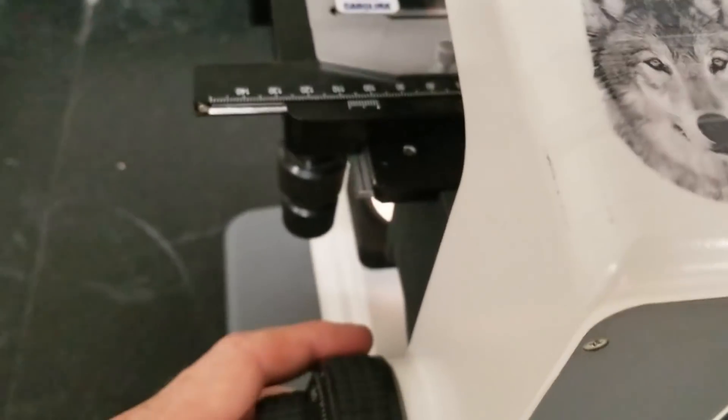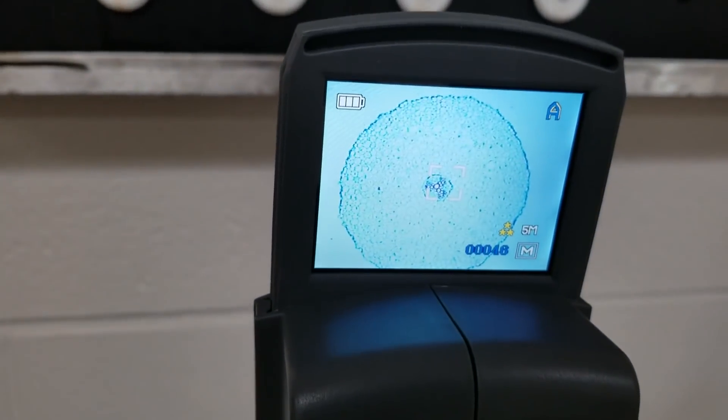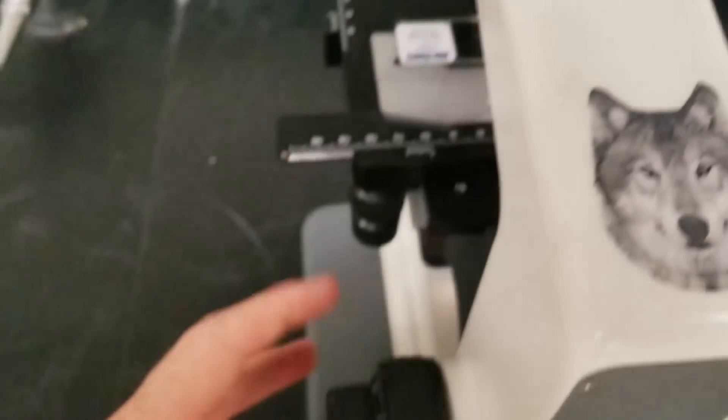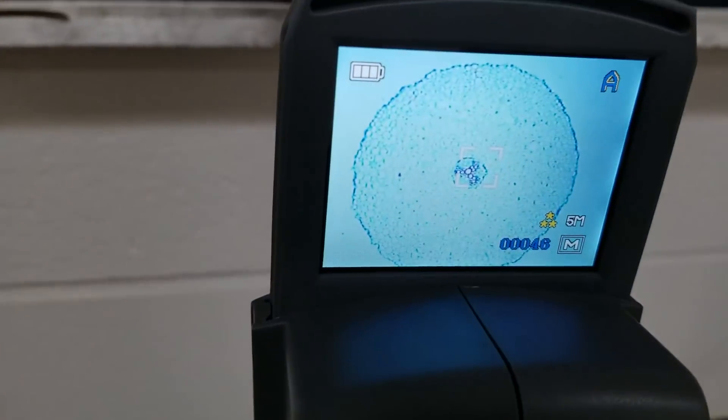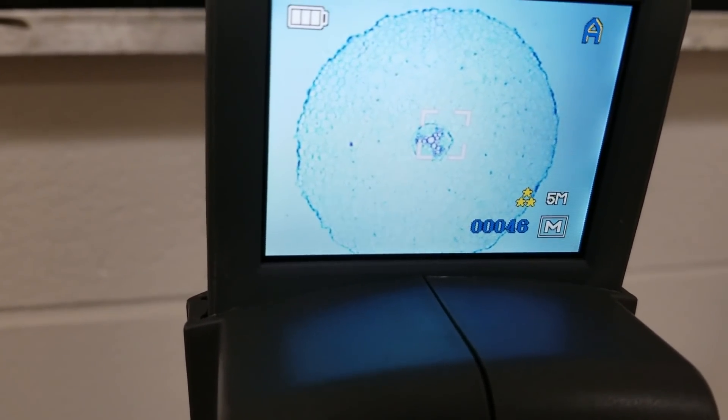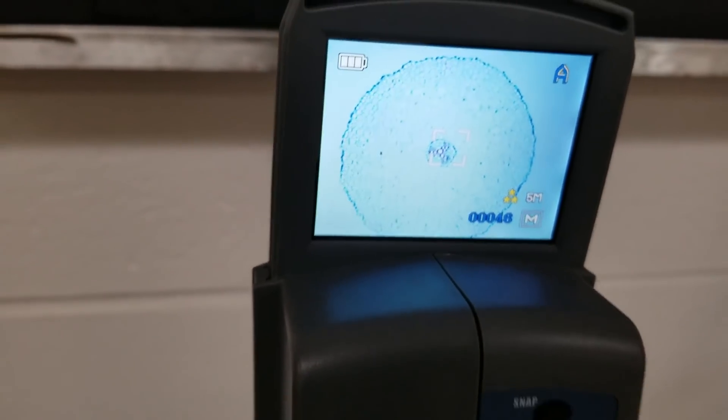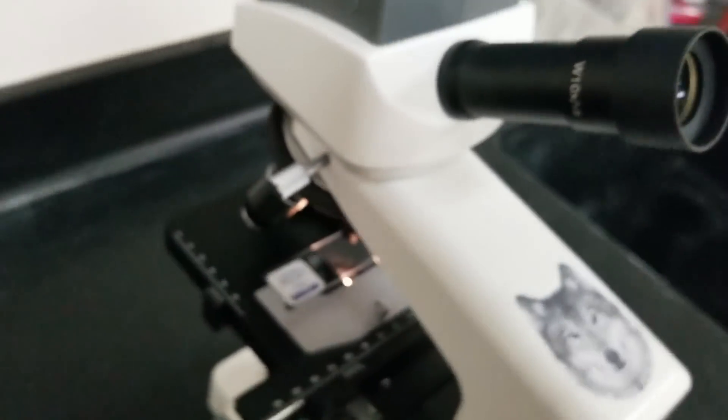Remember, coarse adjustment knob is the big one. That's pretty clear. Then I'm going to use the fine adjustment to make it as crisp as I possibly can. That's pretty good. So that is on the lowest objective. Now we have found the thing on the lowest objective.